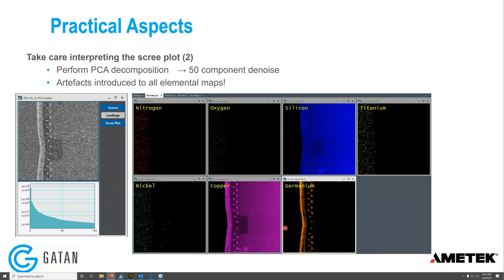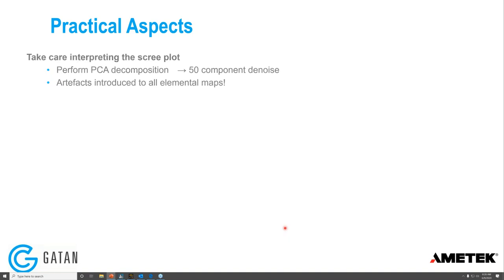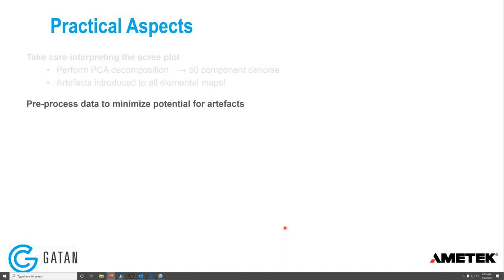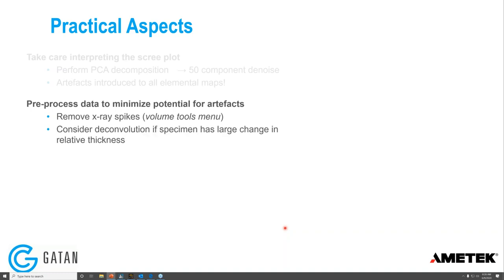It can help to pre-process the data to minimize the potential for artifacts. Always remove x-ray spikes — there's a simple one-click function in the Volume Tools menu — before running MSA decomposition. Consider deconvolution if the specimen has large changes in relative thickness. And you can re-bin the data if it's very noisy to improve the signal-to-noise ratio, also available through the Volume Tools menu.